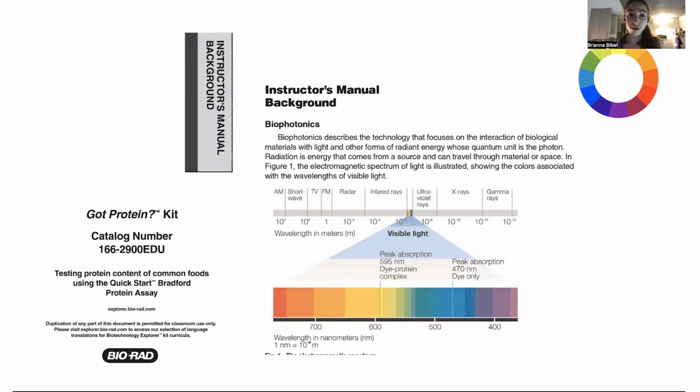And so although you're seeing one color, this bluish color, what that actually means is that you're absorbing in this more yellowish color. And when you see the version that's not bound to proteins, it's going to look more brownish, because it's absorbing more of this bluish light. And so you have to remember that when you're thinking about dye-based methods, you're absorbing at the wavelength that you don't see, not the wavelength that you see.